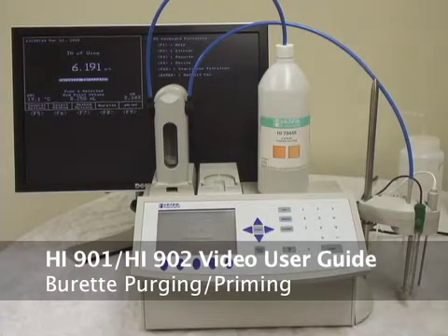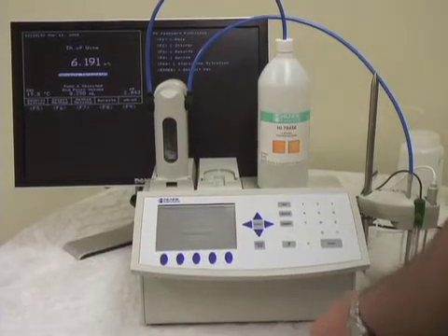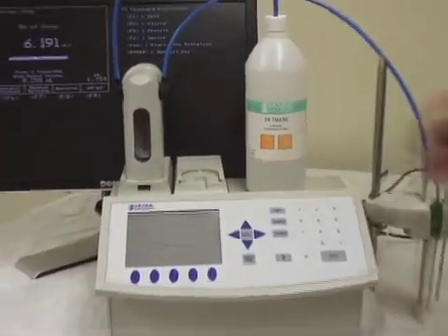Welcome back to Hanna Instruments. We're going to continue with our 901-902 training. Real quick, we're going to go over purging and priming the burette, preparing for a sample. We've already selected total acidity, and we have our 0.1 sodium hydroxide ready to go.